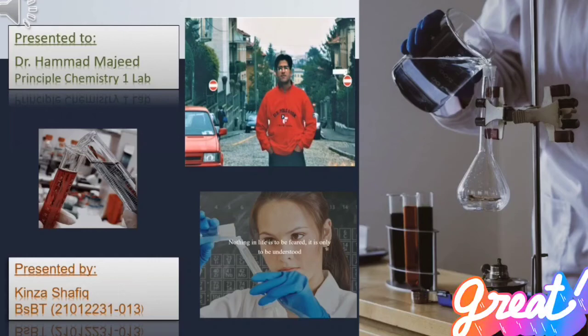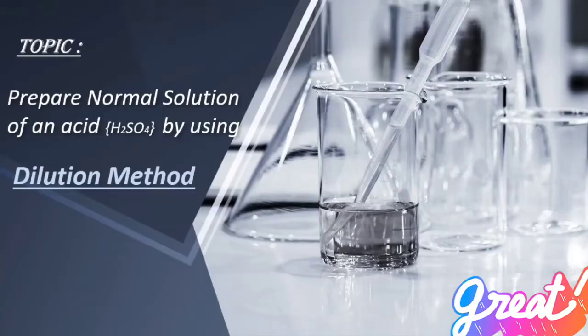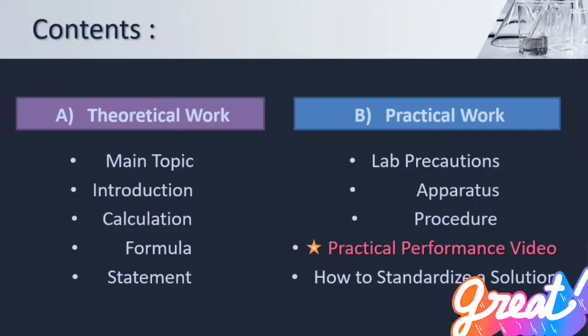It is presented to our most respected and multi-talented professor, Dr. Hammad Majeed, who always used to say, so the students also follow their mantra and speak it loudly in a single voice that, this is the main topic of our presentation: prepare the normal solution of an acid by using the dilution method.